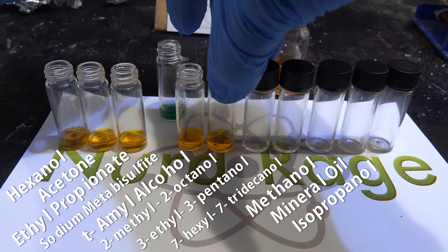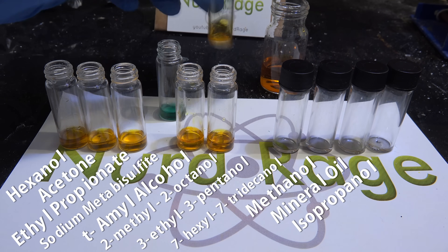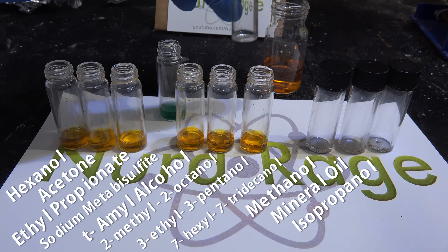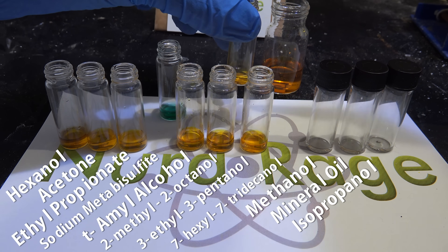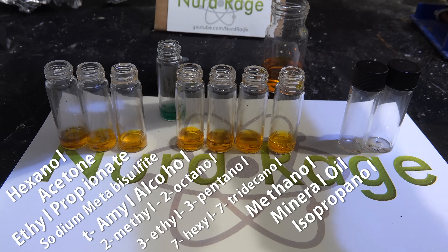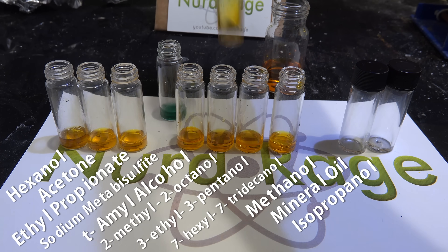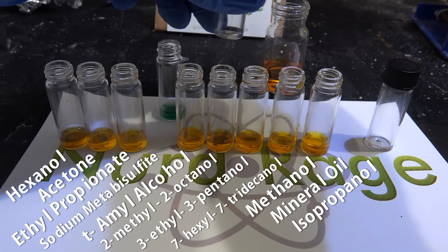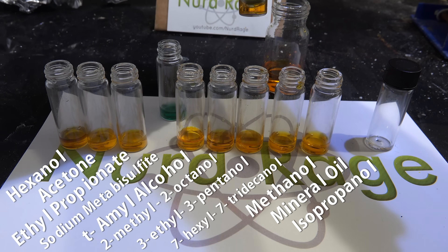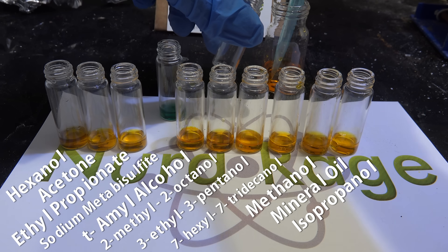I'm putting the sodium metabisulfite back over here because it was releasing sulfur dioxide gas — I wanted it to air out a bit so the gas doesn't waft over and interfere with the vials beside it. You can already see it reacting with the dichromate and changing color. Sodium metabisulfite is a well-known reducing agent in chemistry, and as you can see it works very quickly even at cold temperatures. It also gives you a sense of the degree of color change you can expect. The dichromate test is not limited to just organic reducing agents.